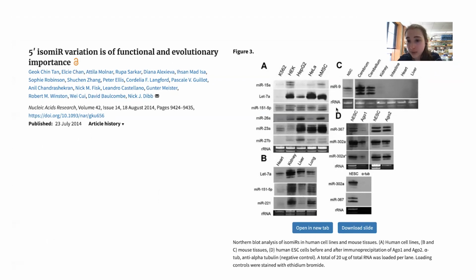So if you probe for part of the microRNA, you see these different lengths, where they have extra letters added on, or letters trimmed off. You can see this using a northern blot, where you wouldn't be able to see that with something like qPCR. So in addition to seeing the levels, you'd be able to see these different modifications on them.